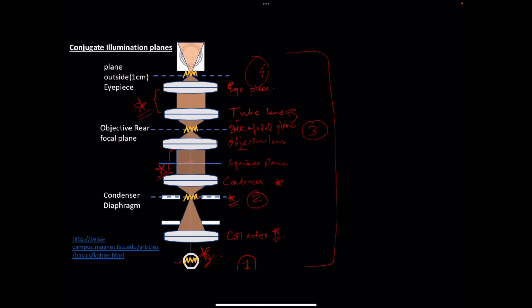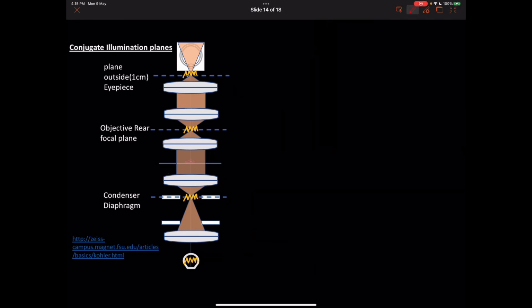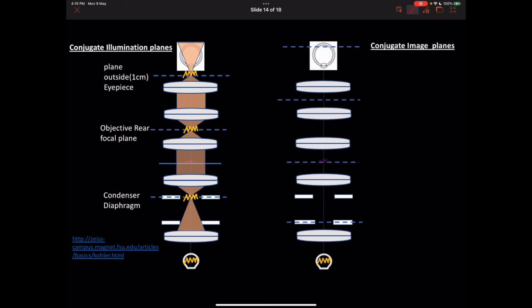Please watch this once again before you jump to conjugate imaging planes. I'll clear all of this and we will move to the next part, another set of conjugate focal planes, referred to as conjugate image planes. Now, what are conjugate image planes and why are they different from these? This will be a question. We will answer it in 1 minute.